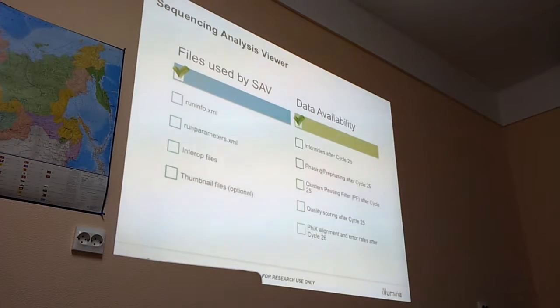And then if you see suddenly some drop or something strange, then you look at what cycle it happened, and then you can look at the images before this cycle and afterwards. And this really often helps to understand what happened. And this is also what is interesting then for the support, either Interlabservis or tech support.